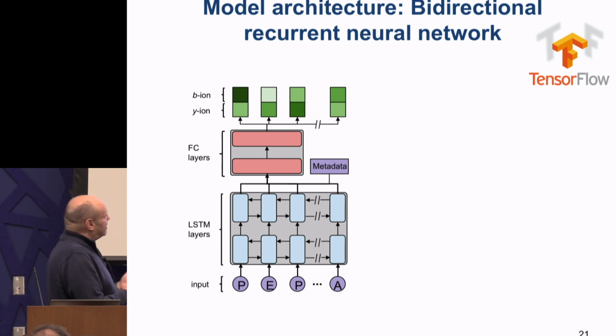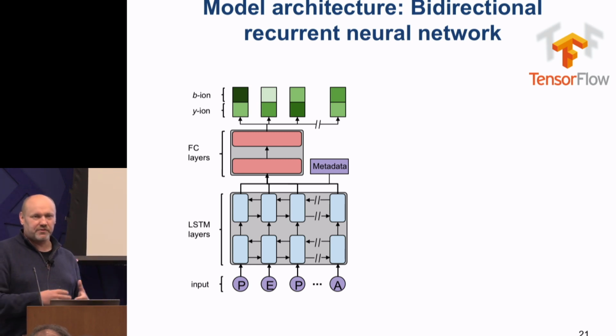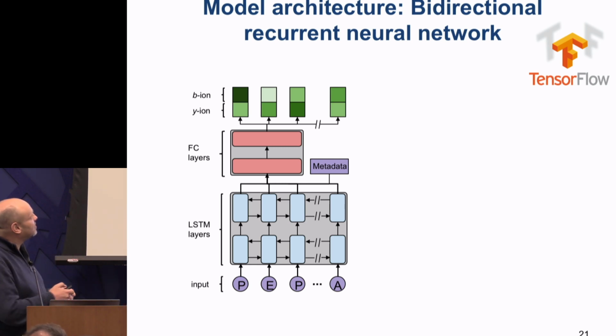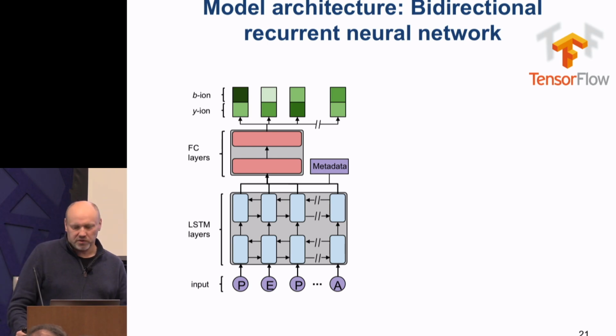The idea is that there is only one model that knows everything about peptides, so you don't need to retrain models for different classes of peptides, not even speaking of peptide length, which would be crazy. Then on top it outputs the intensities for the ions you're interested in: b and y ions, but also, for example, neutral losses of water and ammonia.